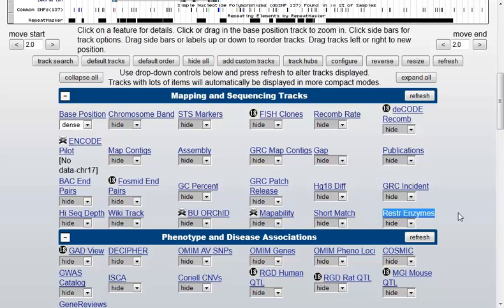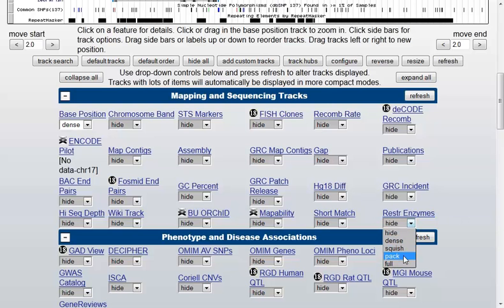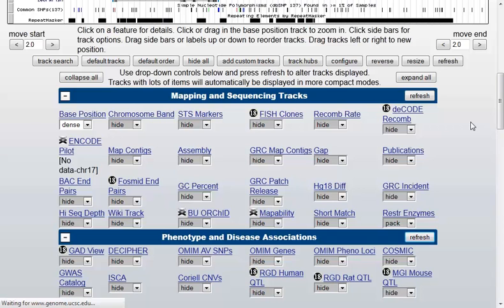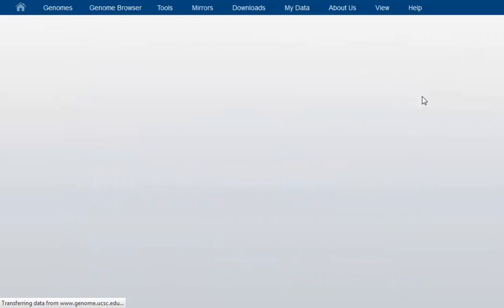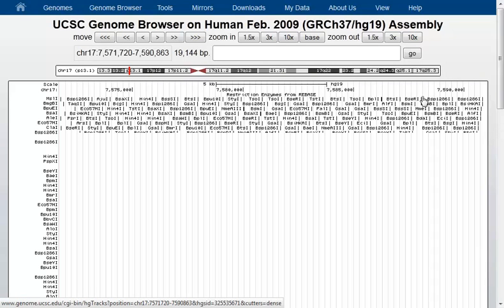The Restriction Enzymes track is hidden by default when you first arrive, but all you have to do is choose to display it with one of the display options. I'll choose Pack — when I don't know what the display is going to look like, I'll usually choose Pack as a nice efficient strategy. I'll click Pack and then click one of the Refresh buttons — any of the Refresh buttons here.